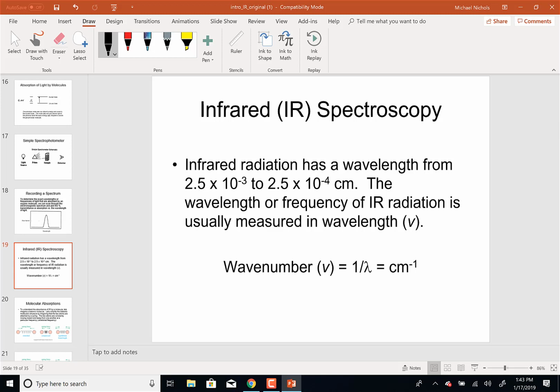Organic chemistry is weird, at least in terms of instruments, and particularly infrared, because when it was developed, they didn't use proper conventions. One of the things we're going to see is peaks don't go straight up, the peaks are upside down. So the baseline is going to be at the top of the spectrum, and you're going to see peaks that come down. That's not normal, right? Normally we see peaks straight up.